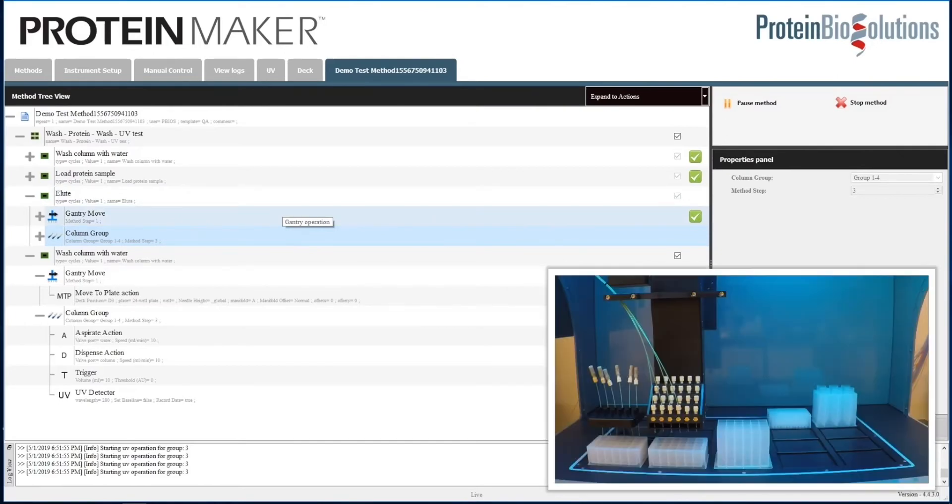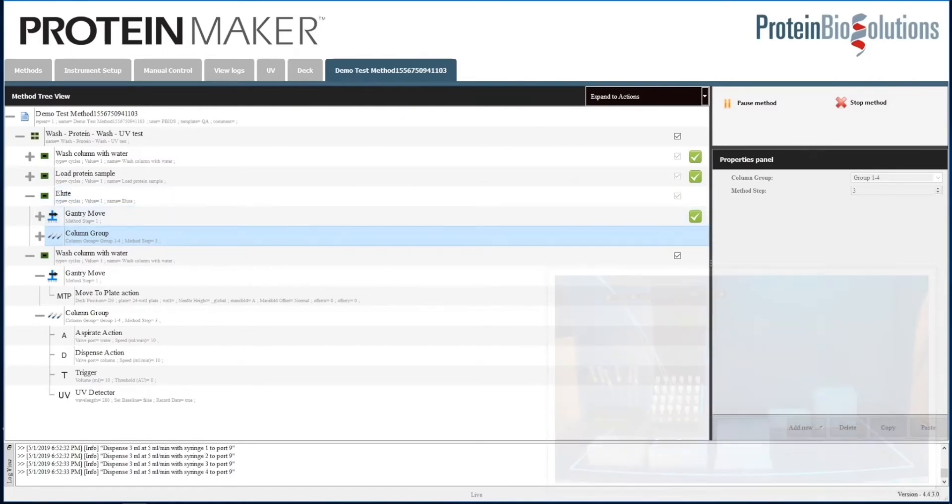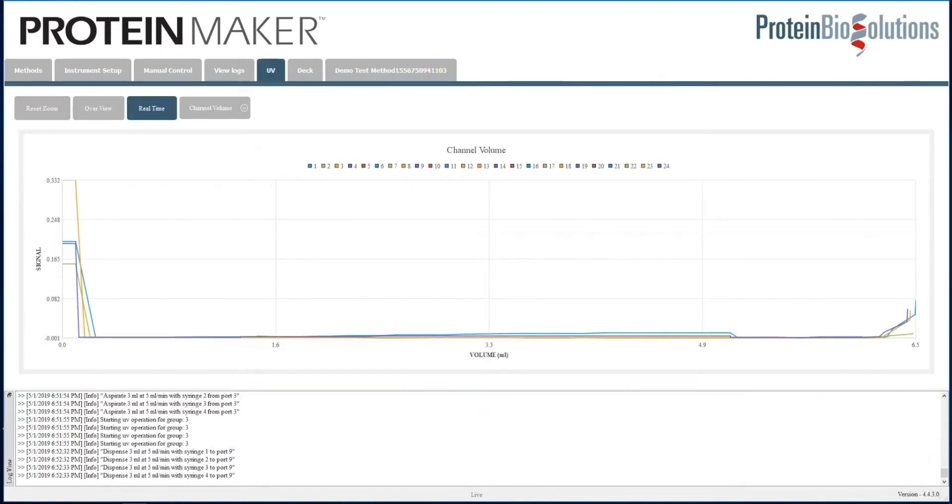This gives you a quick picture of in which plate or fraction the protein has come out. Now that we've loaded the sample and it is sitting on the column, we will elute it directly out for the sake of this demonstration. The robotic arm will move to the next plate position, D2, and elute the protein off of the column and into the plate.